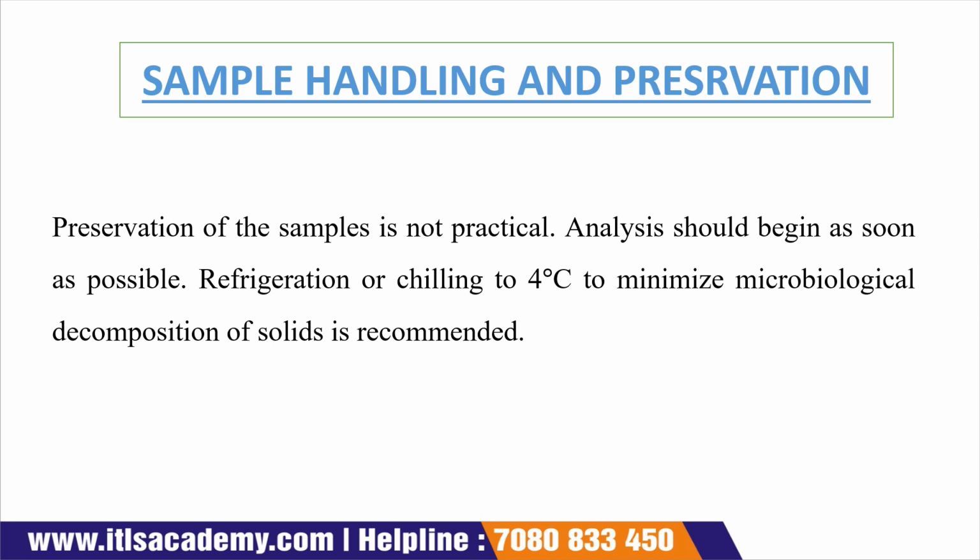Now the next is sample handling and preservation. When we collect a sample, we have to perform the experiment as soon as possible, because it is not advisable to preserve the sample, as preservation of the sample is not practical.